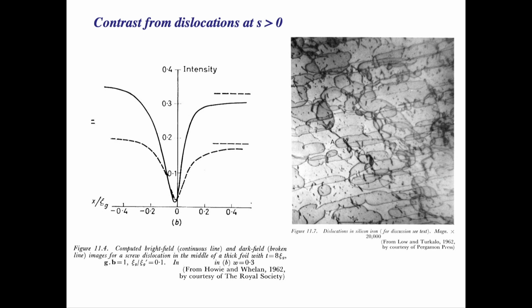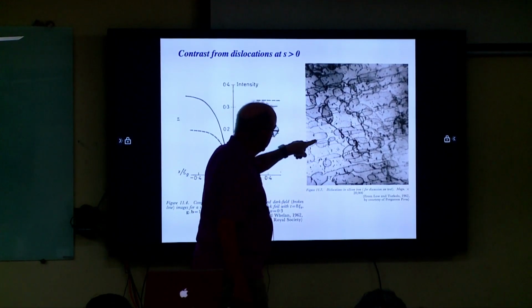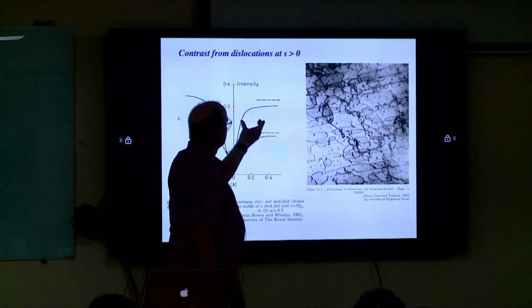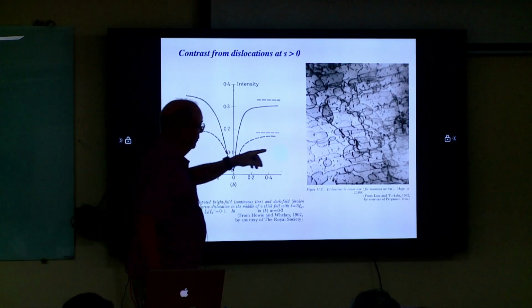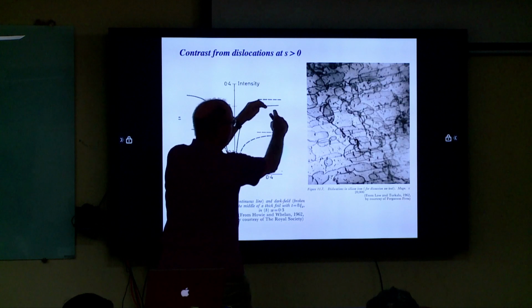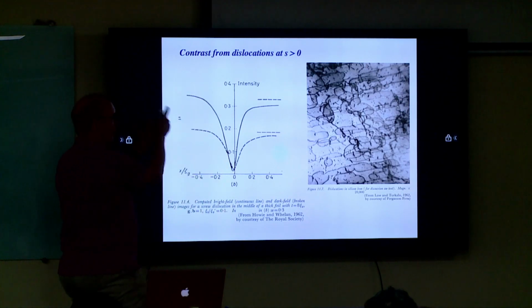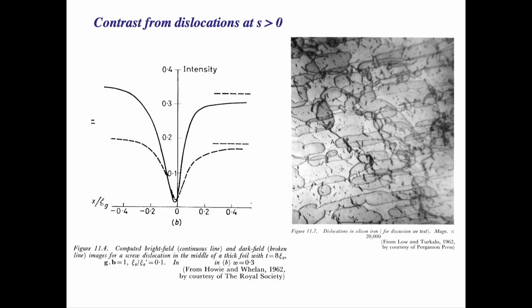That is simply because if you note this dislocation, for example, here, it comes around and back, and around there and back, and this one comes back. So on the one side you have this, and then if I mirror that, it will be below background, or above background if there's another dislocation here. So these are just dislocation dipoles, right? They're just switched. The below background here would be this one with another dislocation here, and the above background between these two would be this side here, and one mirrored, and then the high background intensity. So immediately you would say those are dislocation dipoles, and you'd be correct.